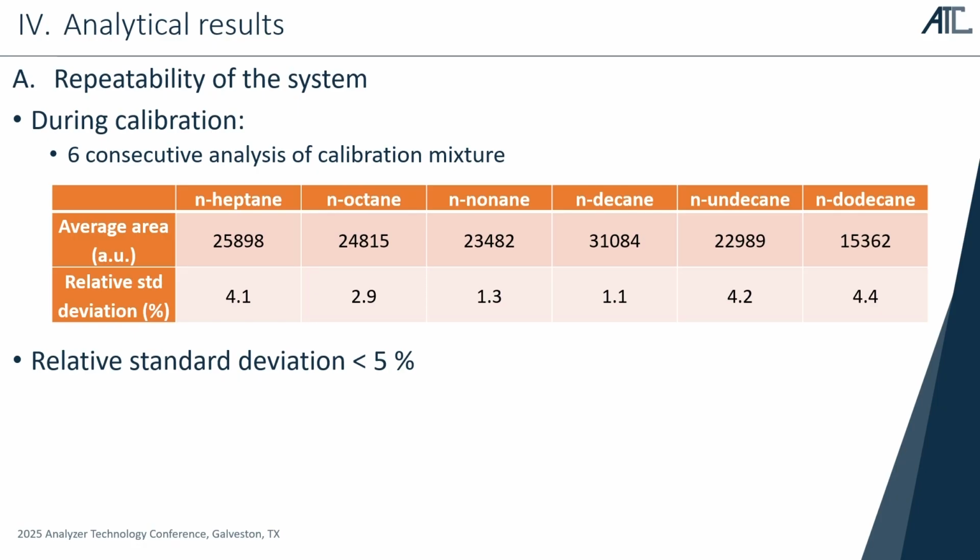This is quite a good RSD because here it's considering the complete analytical chain: the liquid injection, vaporization, GC, and the detection measurement on the peak area of the chromatogram.